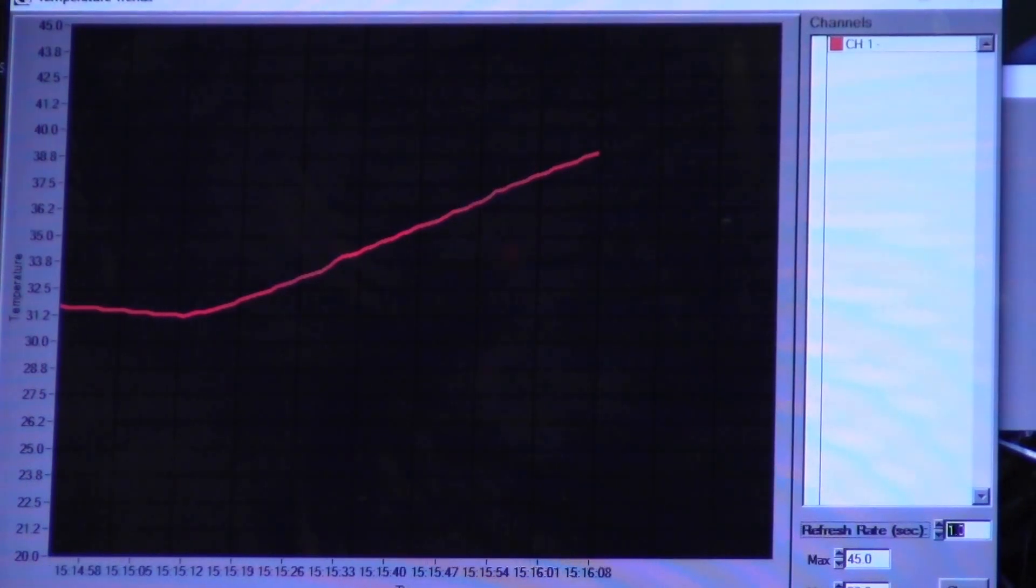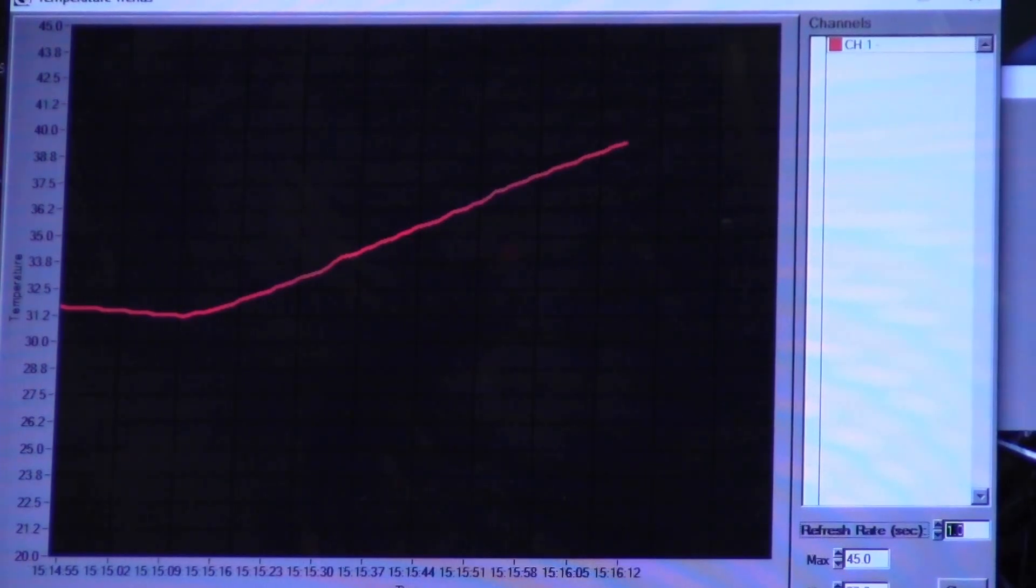We're at 38, 39 degrees centigrade, and we're continuing to climb. All right, I let off on the foot switch so the power is off.